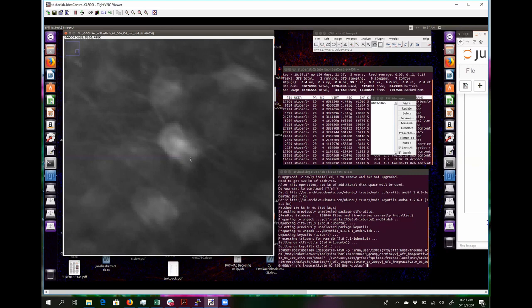So how do I handle this? What do I mean by not accurate? You can pretty much right off the bat see that there's overlap between these cells. If I were to draw the ROI around the big cell, that's probably this whole region. And within that, you can probably tell that this much is actually also occupied by this other cell. You can see this pretty clearly because you will see an increased intensity in the areas of overlap. This area is brighter, which probably corresponds to this other cell being there.